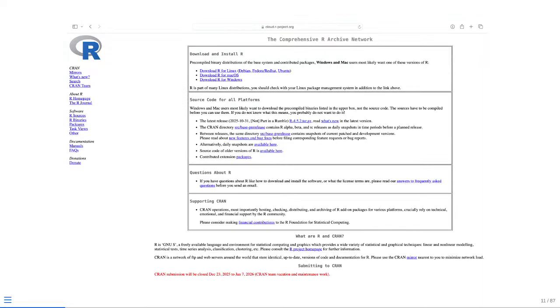So on the next page, this is where it actually does matter. Seeing as you're working on macOS, you want to select the macOS option right up here at the top. If you are watching this video and are actually using either Windows or Linux, you have your own pre-course walkthrough that's specific to your operating system. So please check the website and go to the correct location. Don't try to follow the instructions for macOS. We have put in the effort to make sure everybody's operating system is covered.